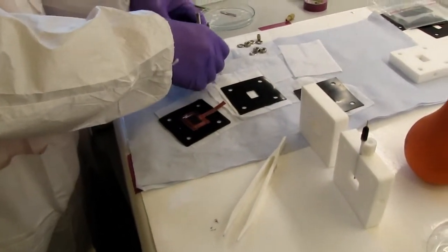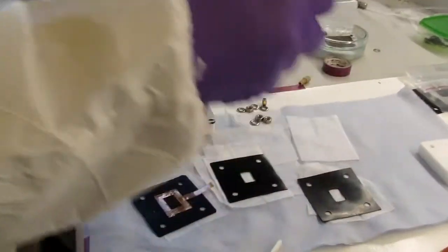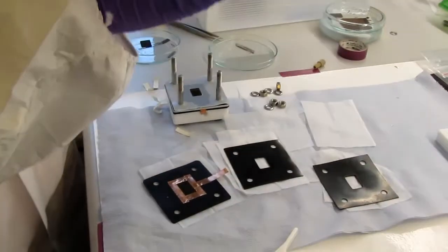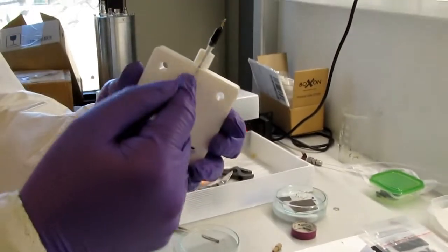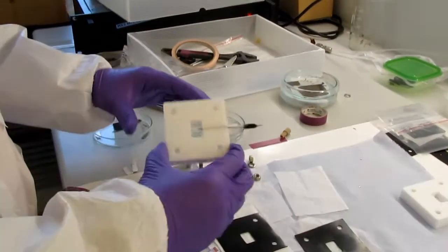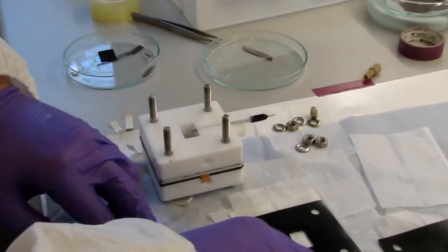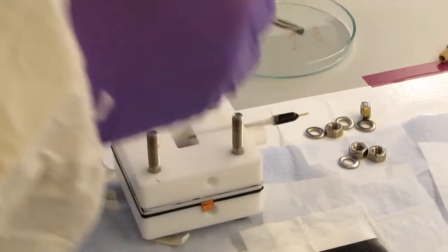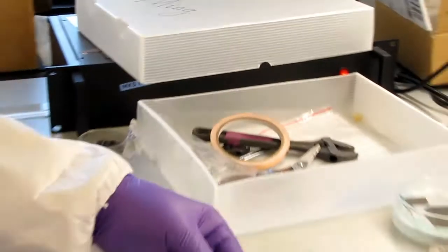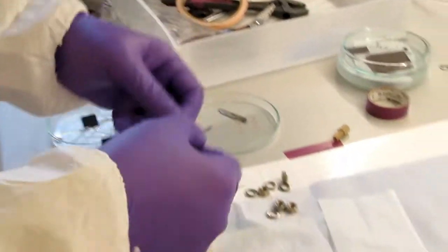Gasket, immobilize the membrane. Then this is the catholyte chamber. So this is the reference we use. Put the catalyst. This is the catalyst side. Catalyst side contacts the electrolyte.